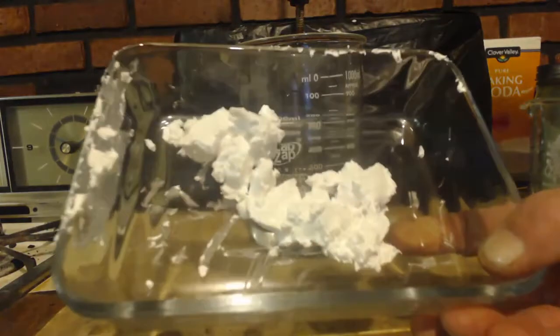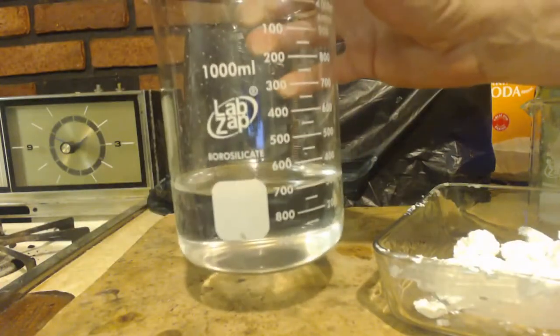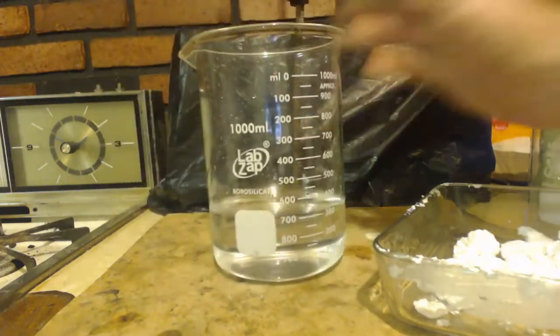And you can see I got some salt making it through the filter. So I'll filter this again. So there's a calcium sulfate I made. This is the stuff that got filtered through. I filtered it again because it had little particles in it. Now it's nice and clear. And I'm just going to boil this away.